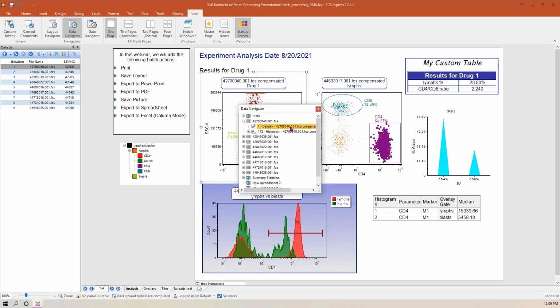So whenever you're using FCS Express, you can click and it will highlight. So it's got that red boundary now. It will highlight the plot where this data file is being used, and it's kind of the unexpected thing. Then I can go ahead and fix that.